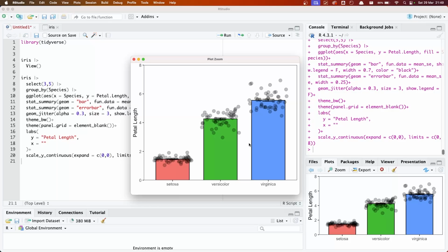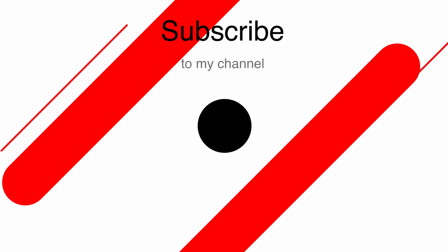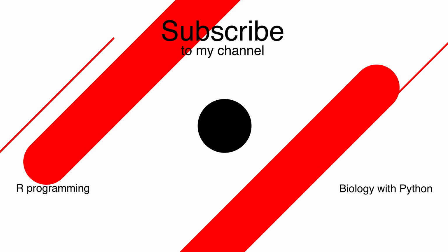And that's about it. That's how you can use the stat summary to calculate the summary statistics inside ggplot rather than using a summarize feature when you're wrangling the data.